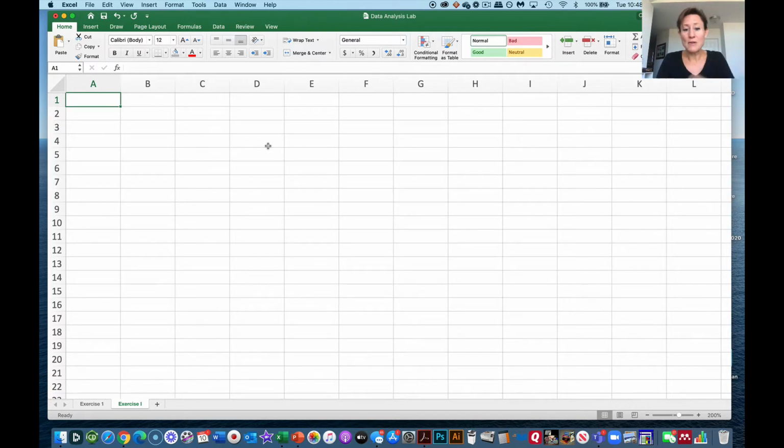I'm just going to read from the sheet here just to kind of highlight some important parts of why we make standard curves. So a goal in much of biochemistry research is to obtain data that can be plotted as a straight line. It's easy to fit to a standard y equals mx plus b equation and obtain useful data from the slope and y-intercept. And we've seen several examples of that so far in this course.